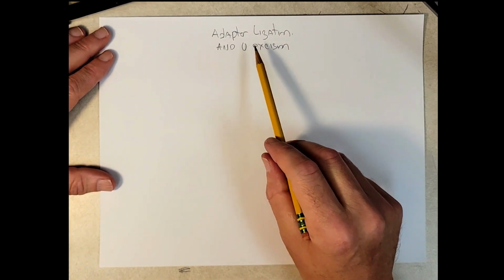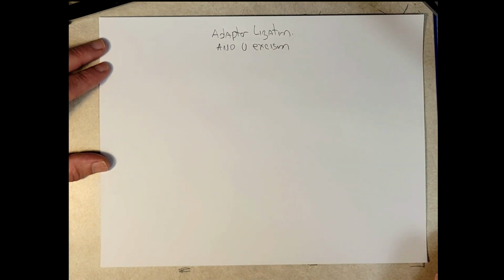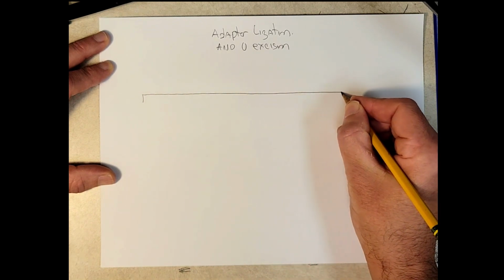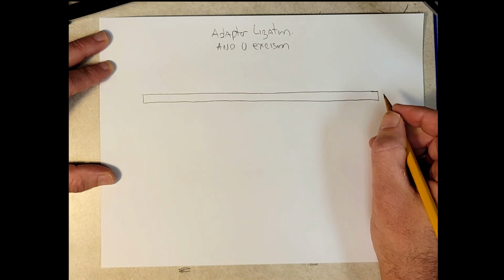Now, what is this adapter ligation? All of our DNA molecules are essentially just parts of a genome that have been end repaired and had A tails added to them. But we need to add sequences onto the ends of these DNA fragments in order for them to be sequenced. So adapter ligation is a critical part of the library preparation method. The NEB Next adapters are 65 nucleotides long. And I'm saying nucleotides instead of base pairs because the adapters are single-stranded.